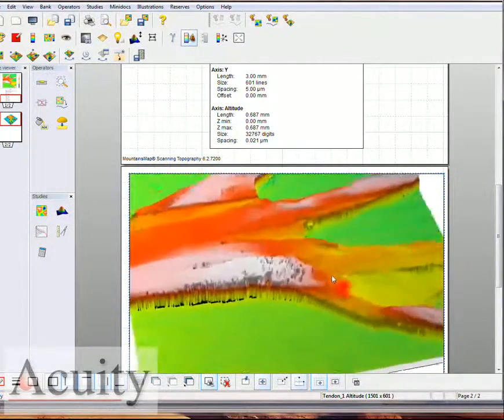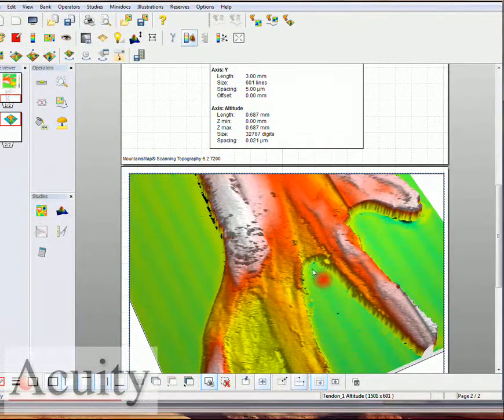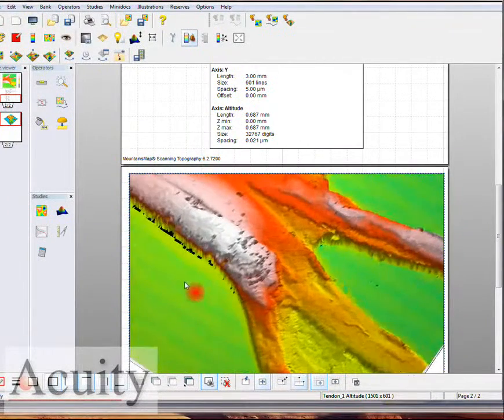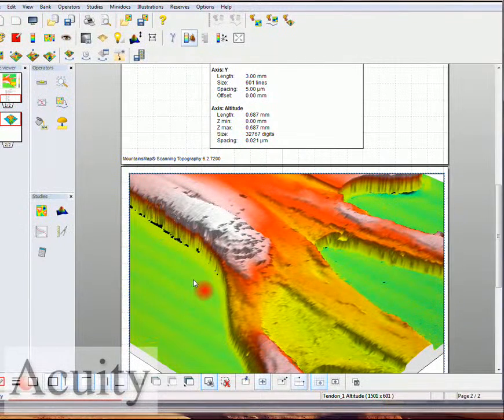No doubt that we can make that measurement. We just probably have to, normally in a production environment we would go a lot faster so you wouldn't have to take this long. I would imagine you could get 15, 20 scans across here in a matter of 20, 30 seconds, probably a second a scan.